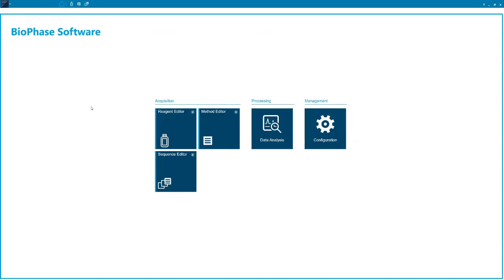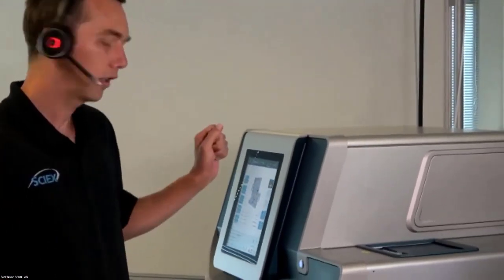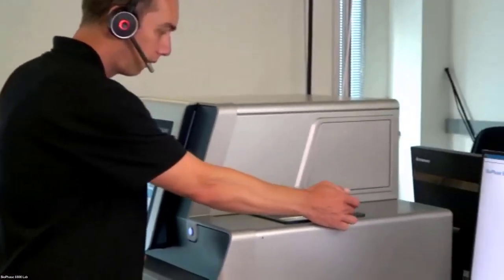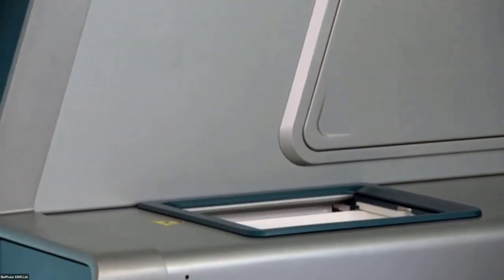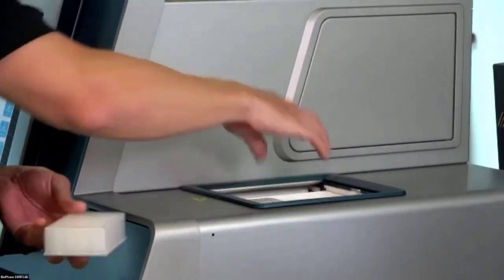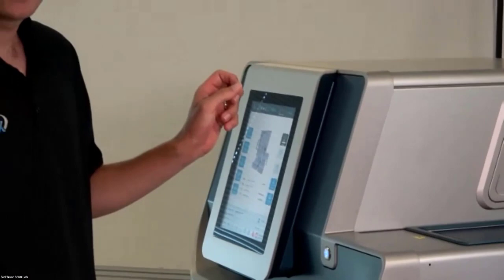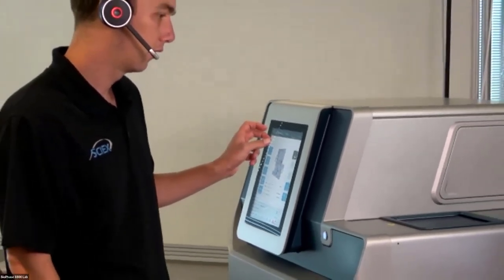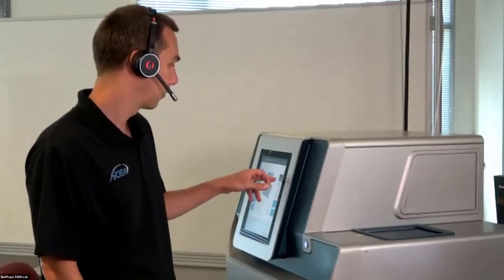So now we can switch over to looking at those reagent plates that we have, loading them onto the system. So right here, we're going to go back to our direct control screen. We're going to eject the sample. Then you can see this partition here open up. Or you can take out your old sample plate and reagent plate. Take your new one. Just pop that right in there. Pop that down. Click the button there on that front panel. You'll see the partition close. And as it gets it into place, just wait for that there.